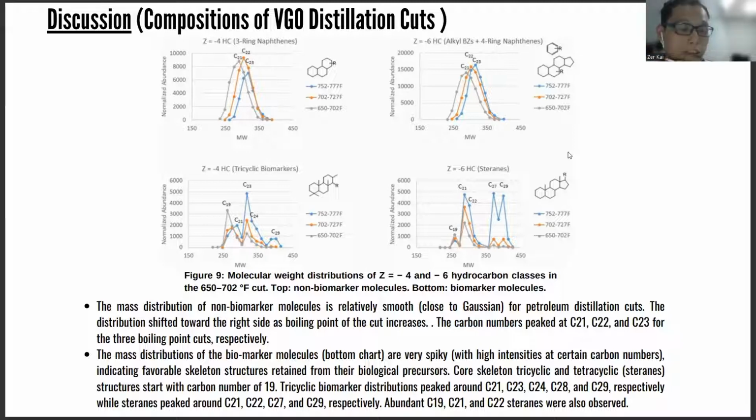So from this article, it really showed that the combination of 2D GC can solve the main problem of GC, which can be used to observe the detail of analytes which have high boiling point and extreme polarity. It can show the detail in graphs and images from the combination of the GC. That's all from me. Thank you.